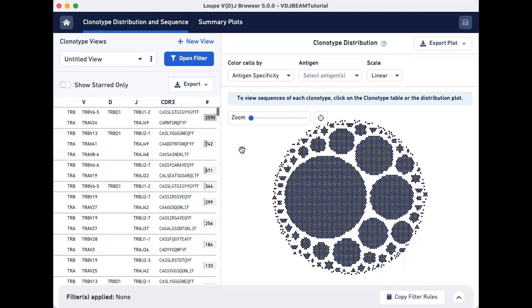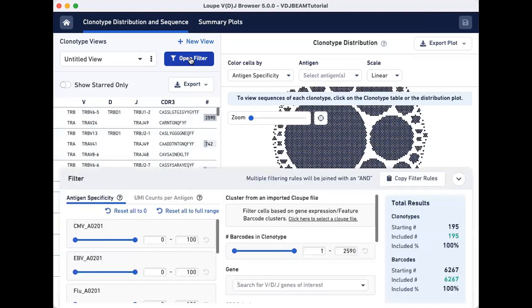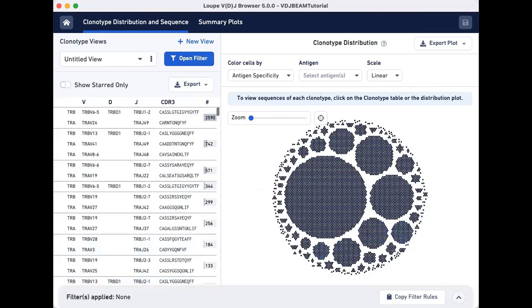Open the Filters window by clicking on the Open button at the top of the clonotypes view panel. Another way to get to this window is by clicking on the Filters panel at the bottom.